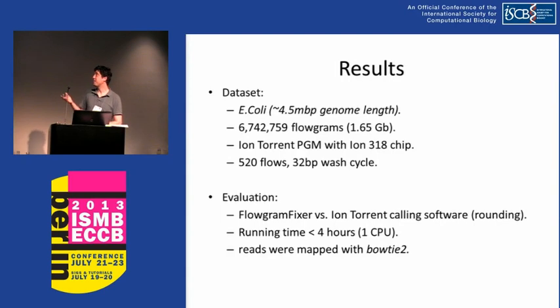It's a standard PGM. Oh, one thing I forgot to mention. In all the toy examples I showed you, we had a very simple repetition over the nucleotides during the sequencing. It was always ACGT, ACGT. This is how it used to work with 454. Actually, IonTorrent have a much more complicated repetition, a sequence that repeats. It's 32 nucleotides long. They have some reasons, I guess, why it's this way.